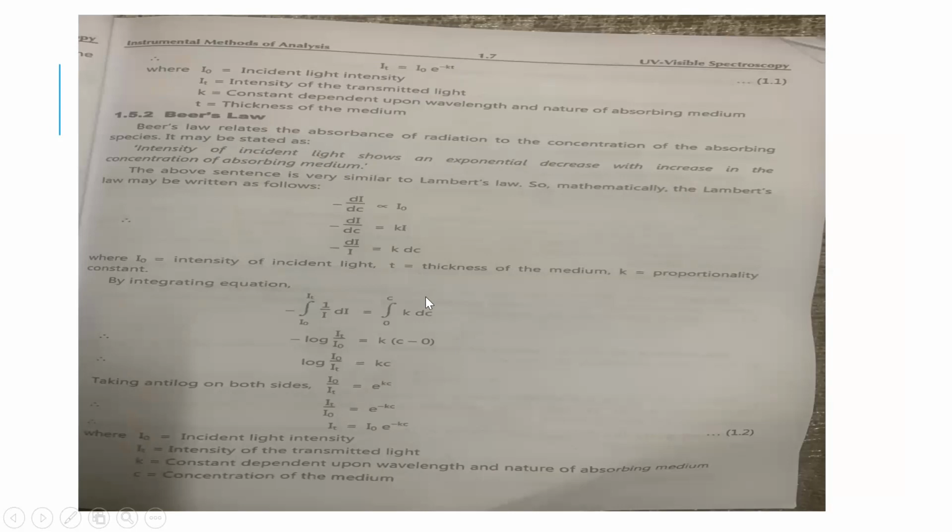In the same way, Beer's law can also be written. First we'll discuss the definition of Beer's law. Beer's law states that the intensity of the light shows an exponential decrease with increase in the concentration. In simple terms, absorbance is directly proportional to concentration, or the decrease in intensity is proportional to the concentration of the substance. If the concentration is more, the absorbance value is more. So the decrease in intensity with the concentration is proportional to I0, the intensity of the incident light. This can be written as minus dI by I is equal to KdC.